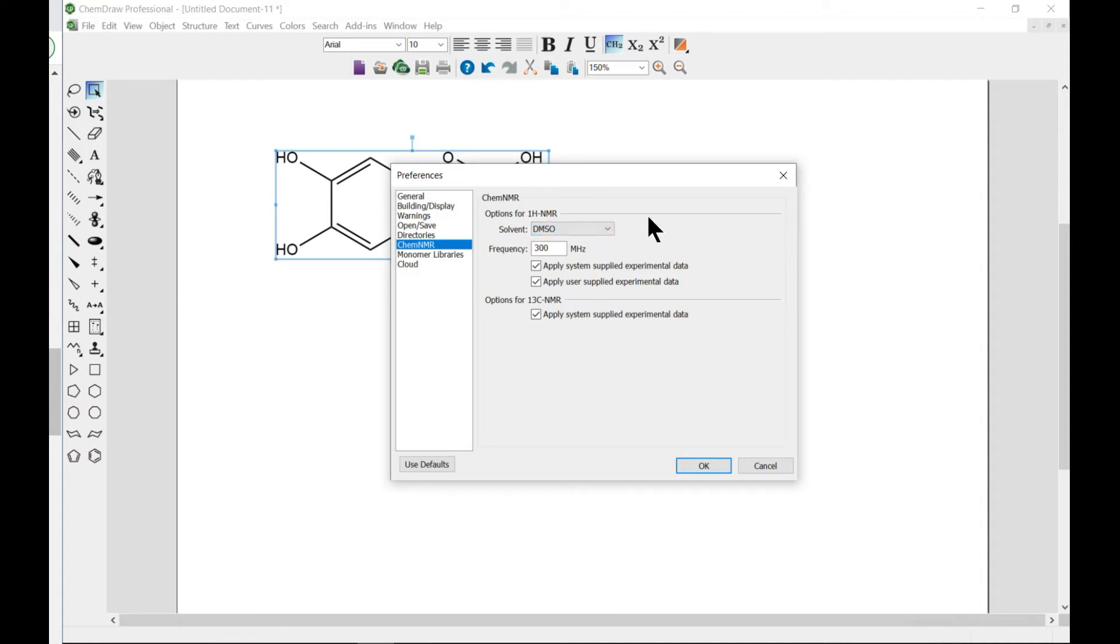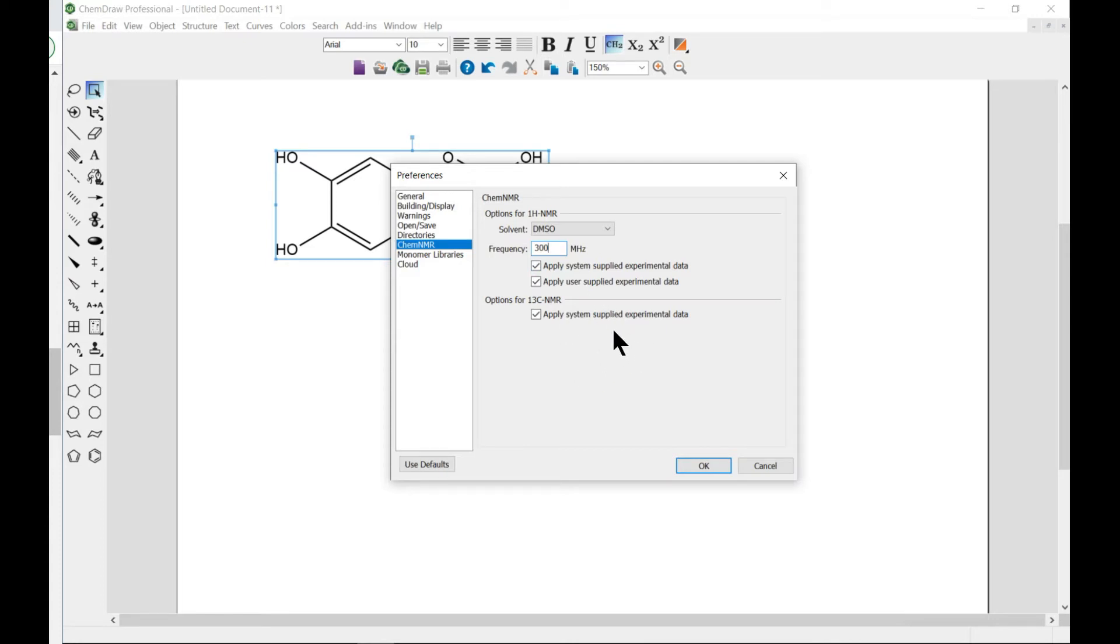You can set one of these and you can also change the frequency and play around these as well. So that is basically how you do ChemNMR or you can set your preferences.